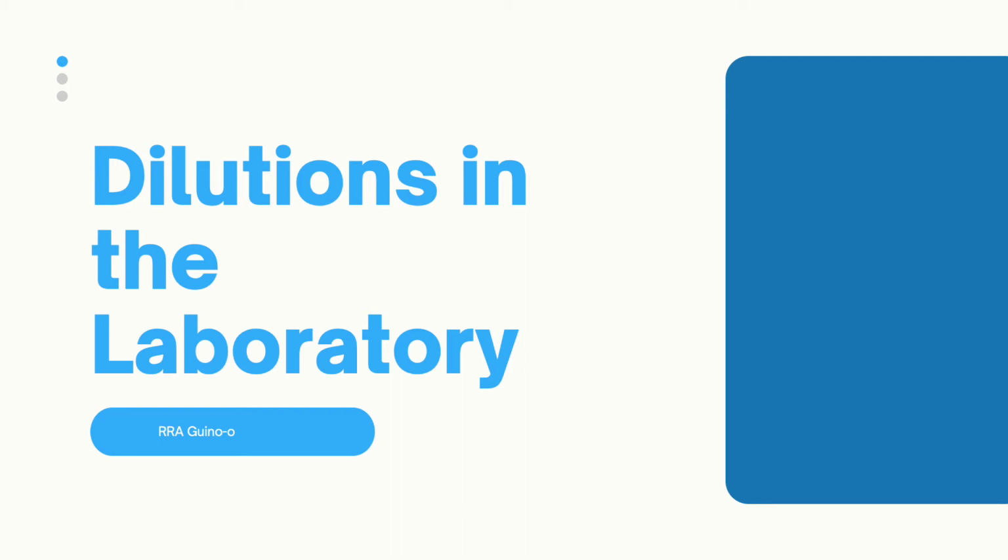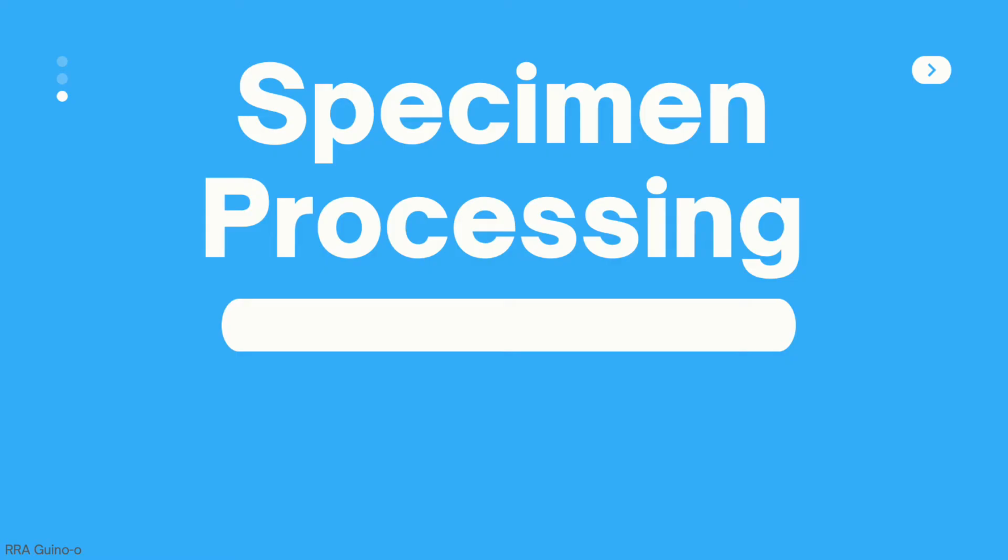Hi everyone. In today's lecture, we will be talking about dilutions in the laboratory. Before we proceed any further, let's first talk about our specimen processing.